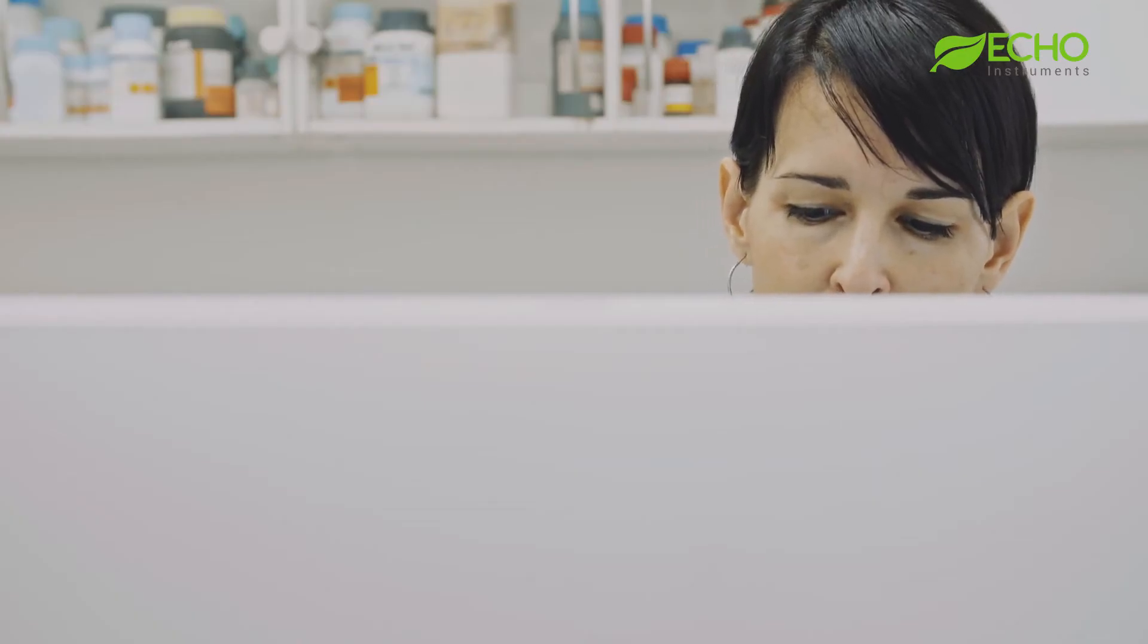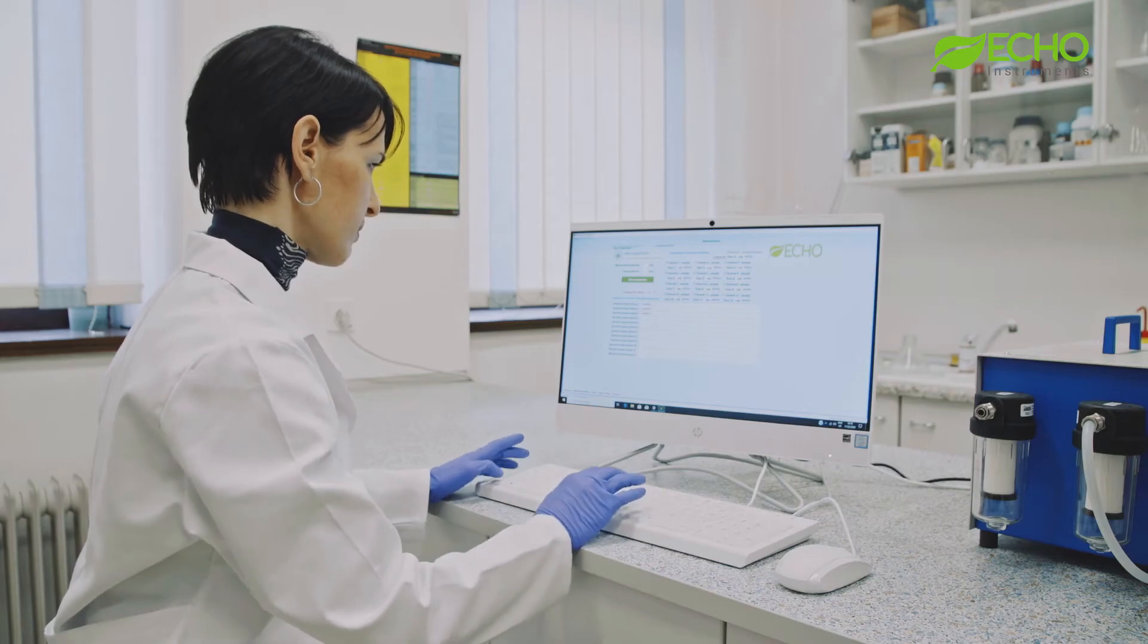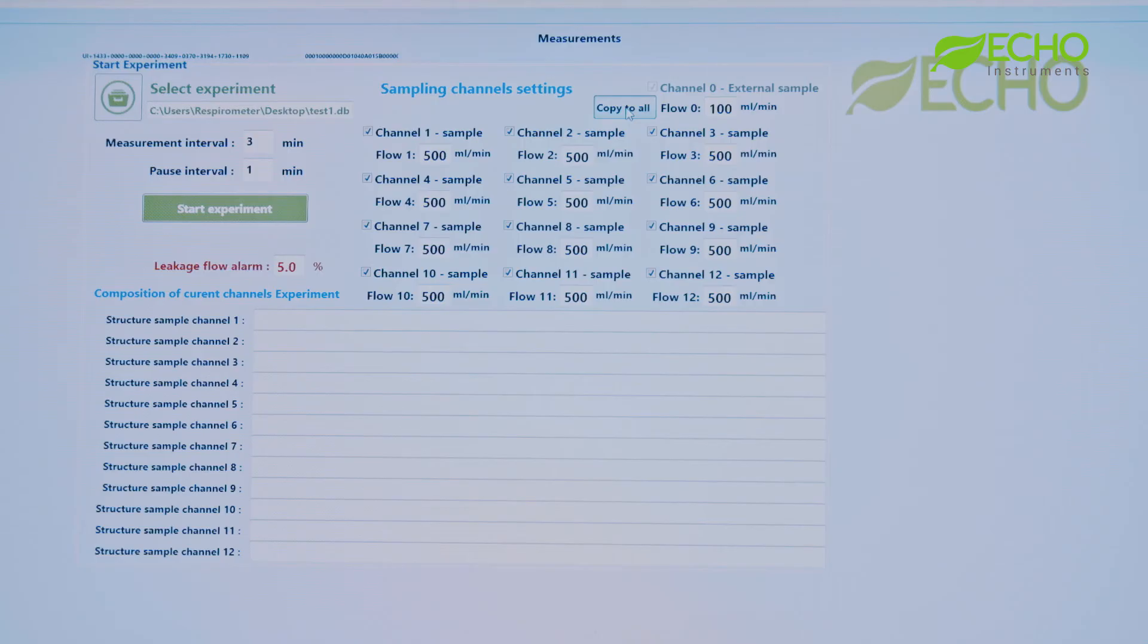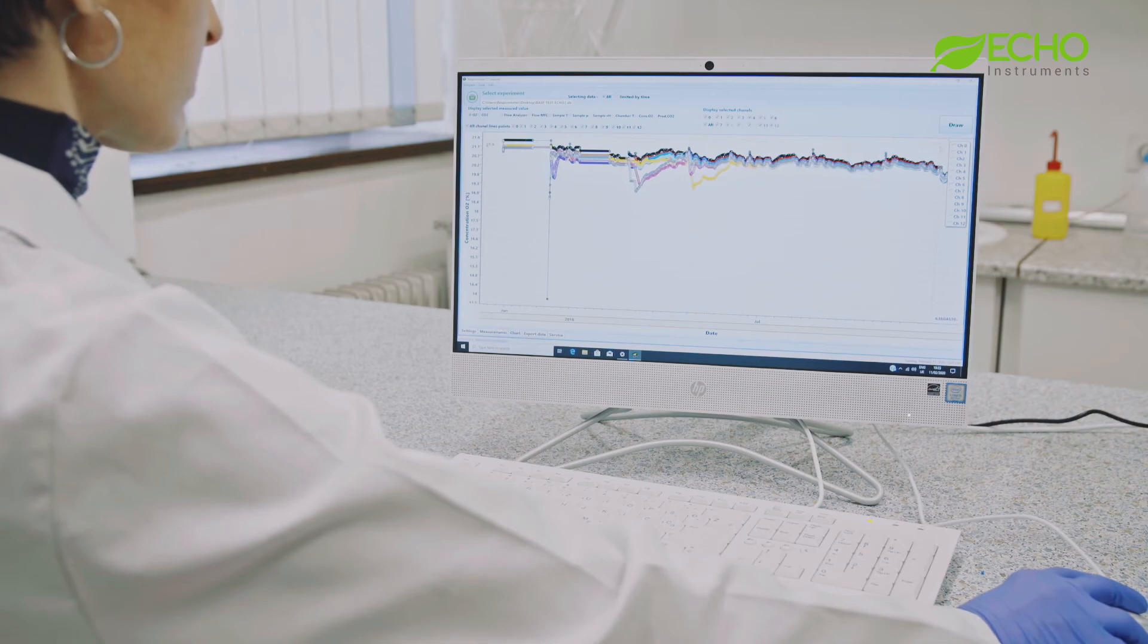Specially designed software for measuring bioplastic degradation enables the customer to follow the process of biodegradation in real-time with a calculated percentage of biodegradation for each sample. It is also possible to monitor each experiment and control the instrument parameters via internet connection and remote access.